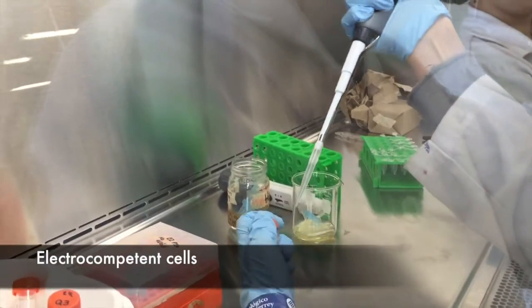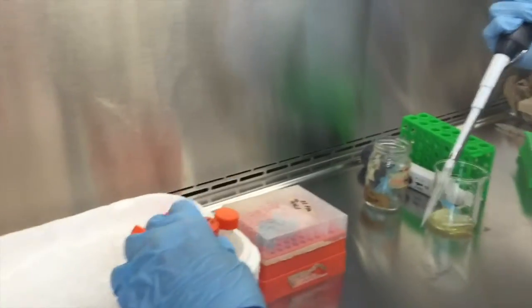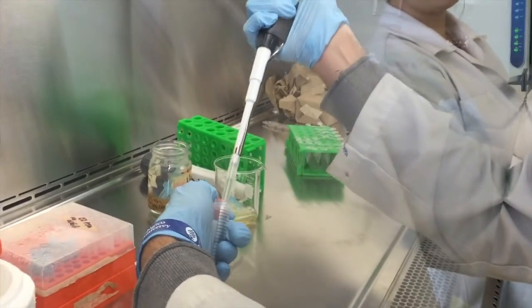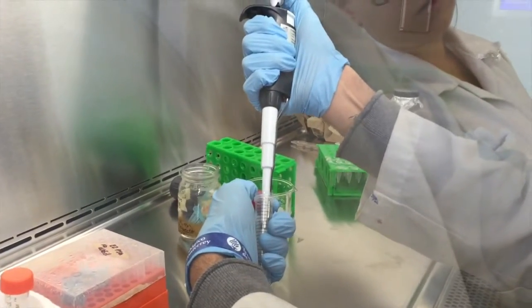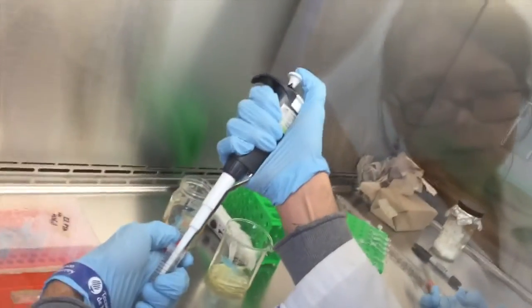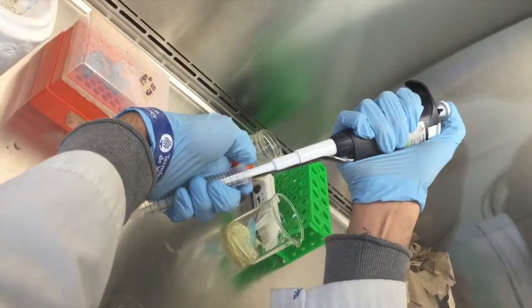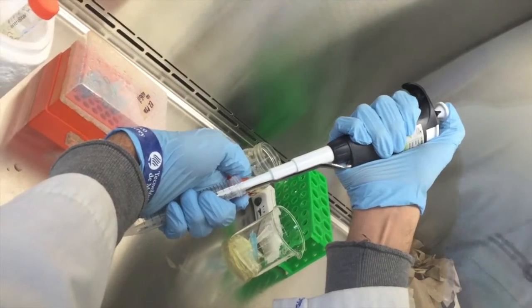For electrocompetent cells, after centrifuge, the supernatant was eliminated and then 10 milliliters of cold glycerol at 10% was added in order to resuspend the pellet. The sample was incubated for 10 minutes in ice and then it has to be centrifuged at 4,000 revolutions per minute.